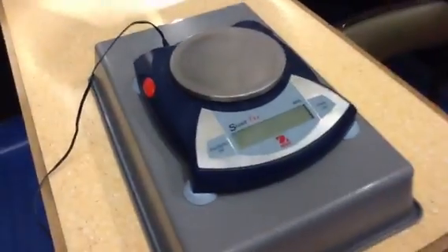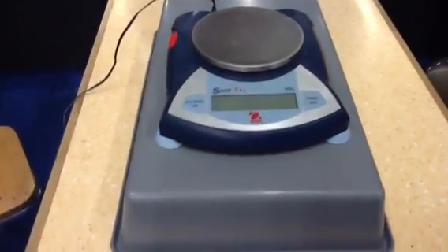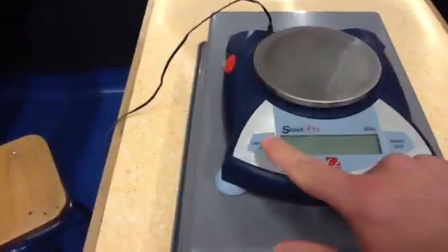This video is about how to use an electronic balance. This is an electronic balance. First of all, you have to turn it on.